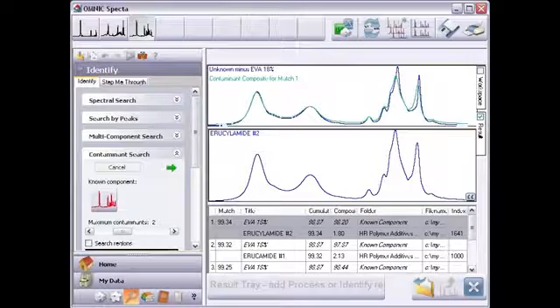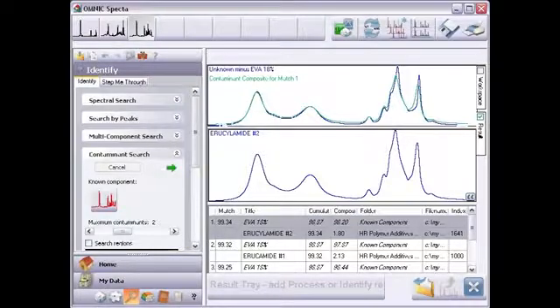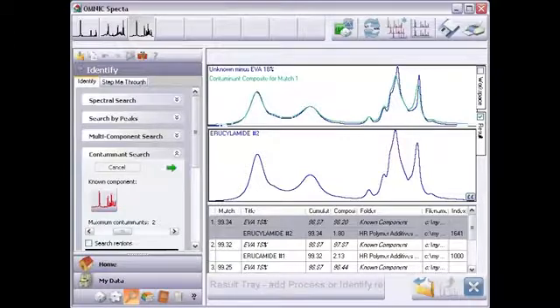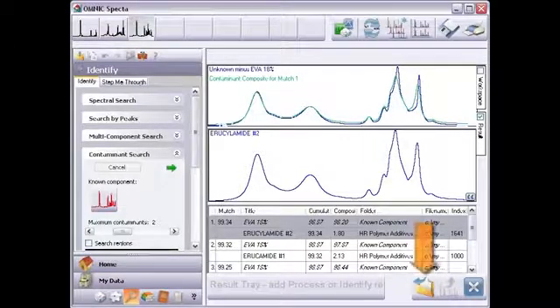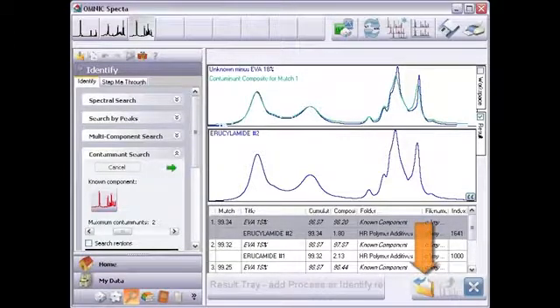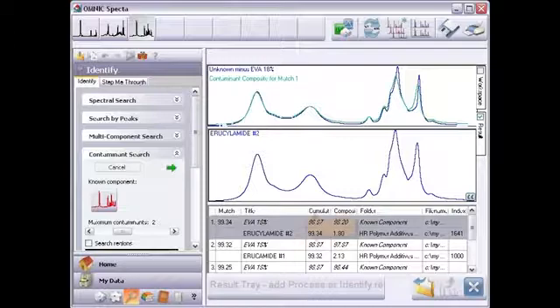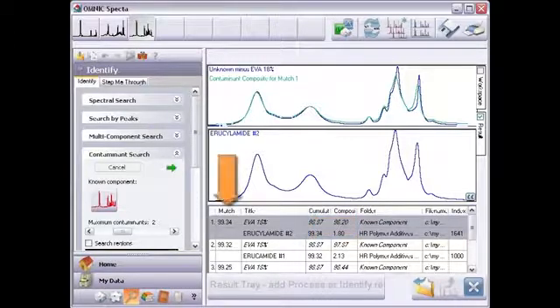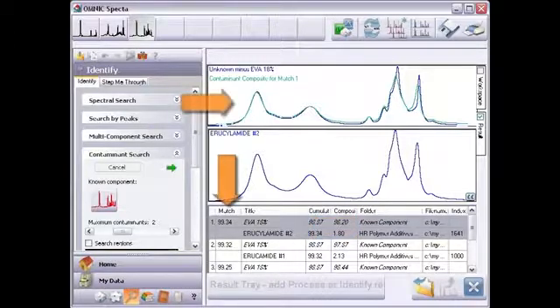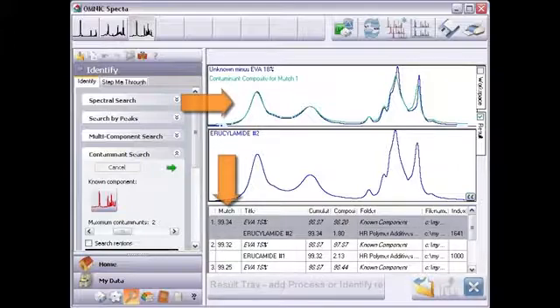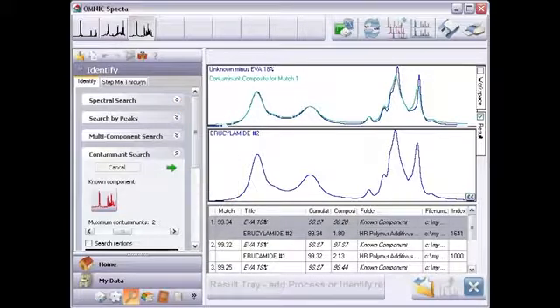Spectra lets you configure and reconfigure the display to show exactly what you want. Note that you can capture each display for placement in a report by clicking this button. The first match contains 18% EVA and erucamide. With an impressive match number that is consistent with my visual comparison, I can be confident that erucamide is indeed the contaminant.